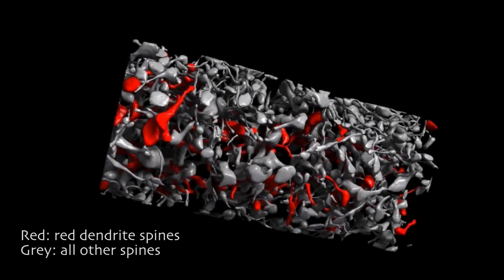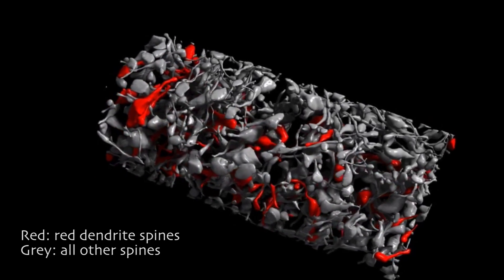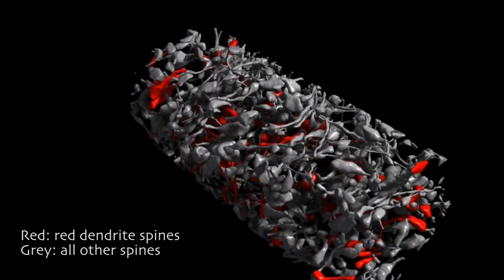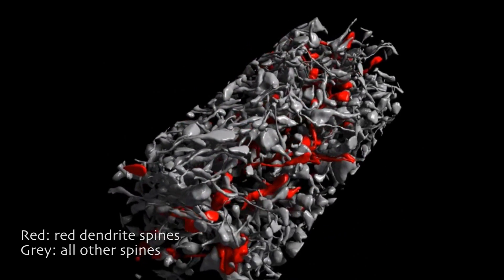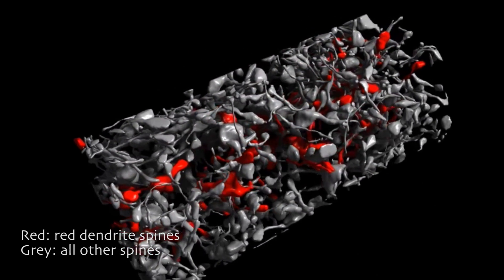An axon that runs through our fully reconstructed volume meets many spines and chooses a small subset of them to make synapses. Which spines are chosen appears to depend on the identity of the axon and the dendrite.